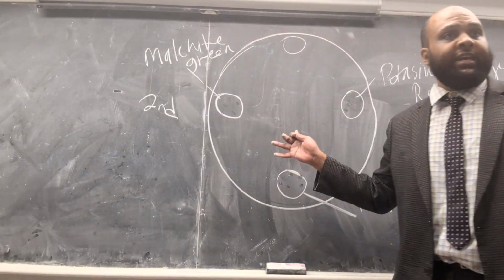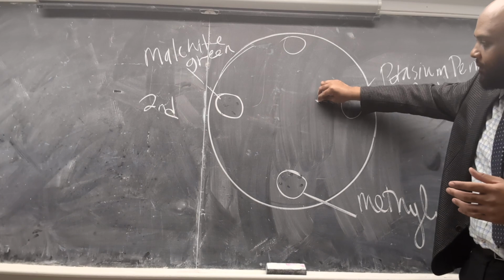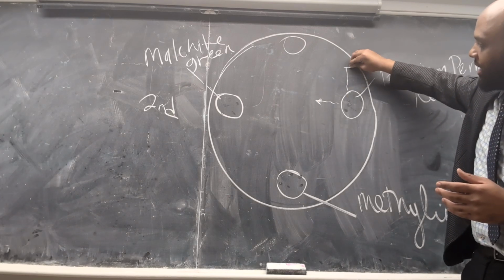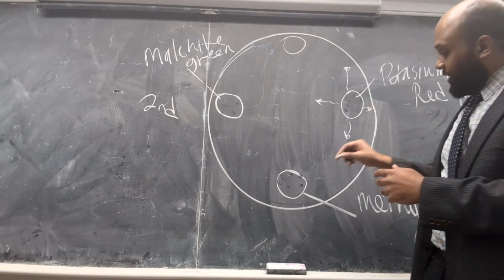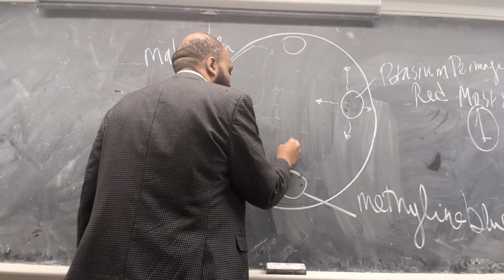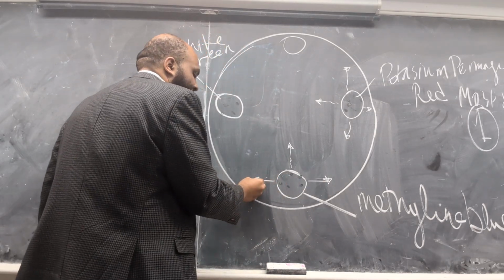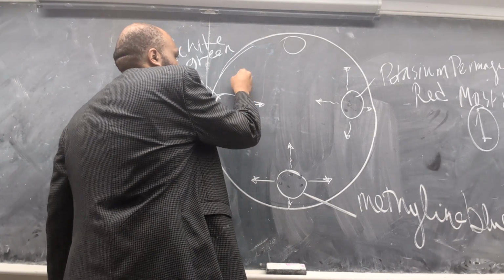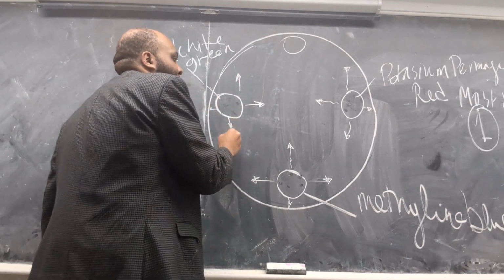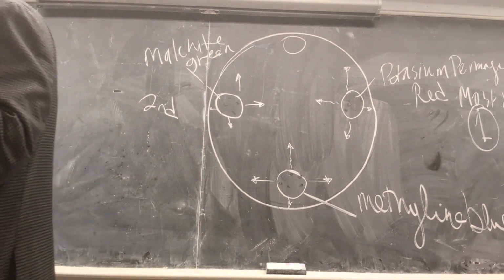They're gonna start diffusing. This one is gonna go to the west, to the north, to the south, to the east. This one too. You can say, let me move upward, let me move eastbound, westbound, southbound. They're gonna try to spread out. But you're gonna find something that's really interesting.